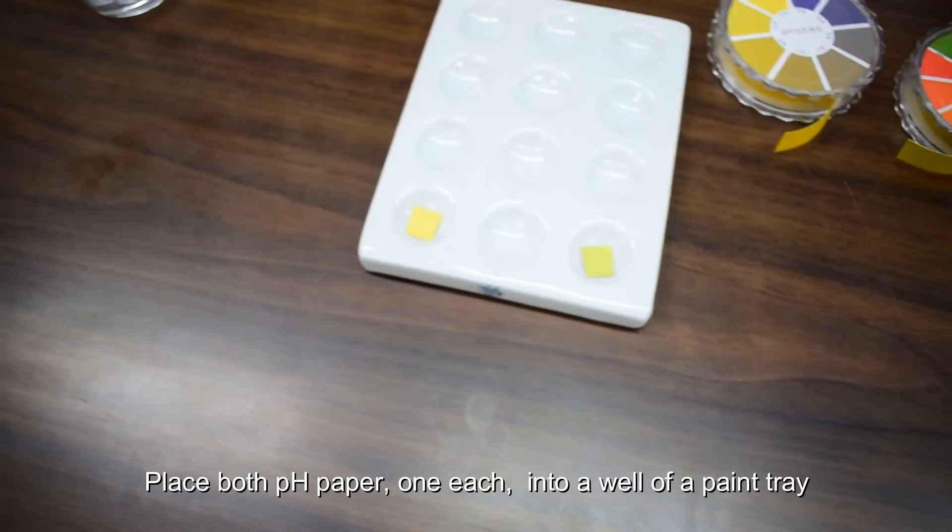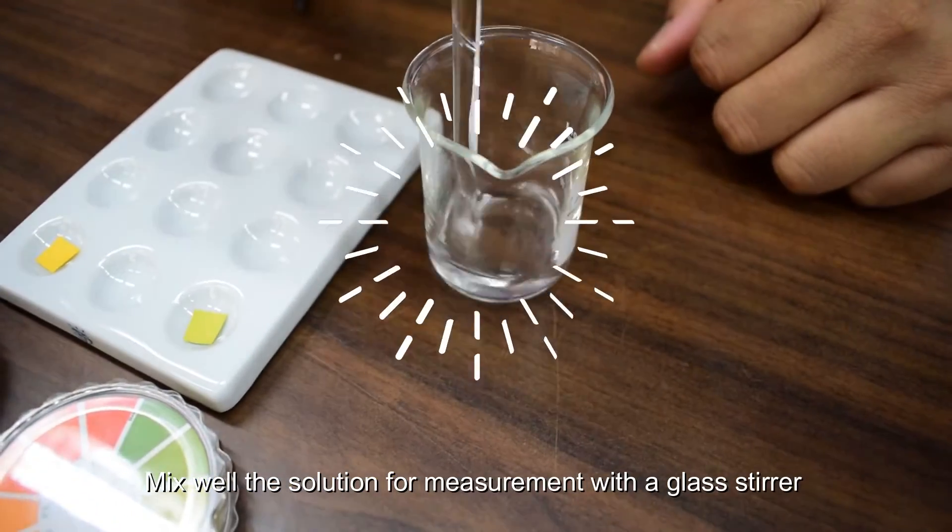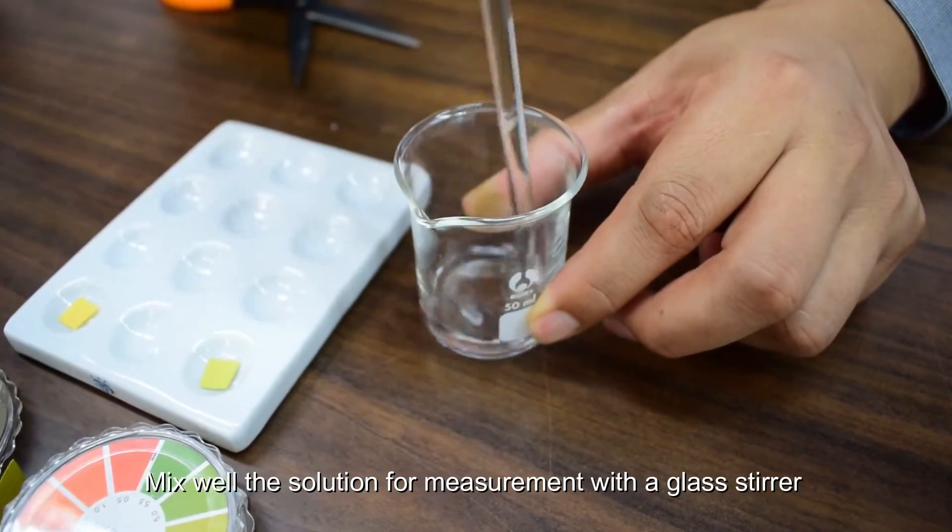Place both pH papers into a well of a paint tray. Mix well the solution for measurement with a glass stirrer.